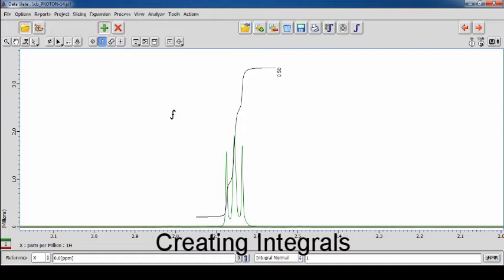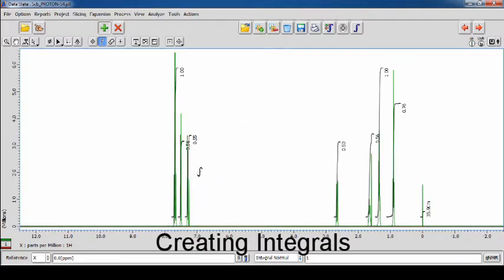Holding the Alt key will force create an integral, which can be useful if you want to draw an integral in a position without selecting nearby integrals instead. The Shift key will create an integral and adjust the integration range to always be within the threshold parameters.